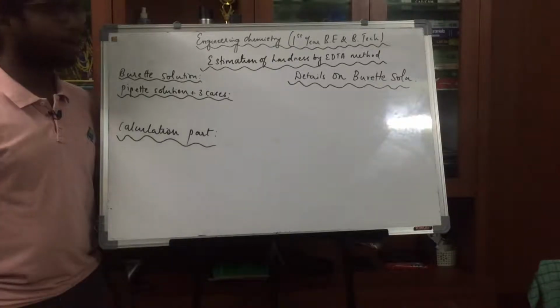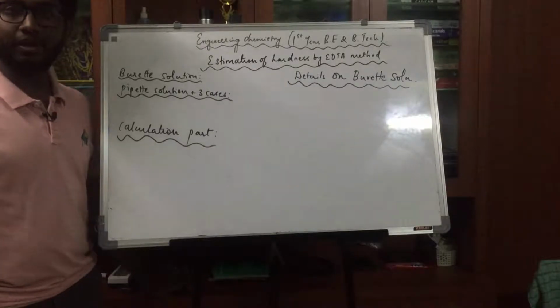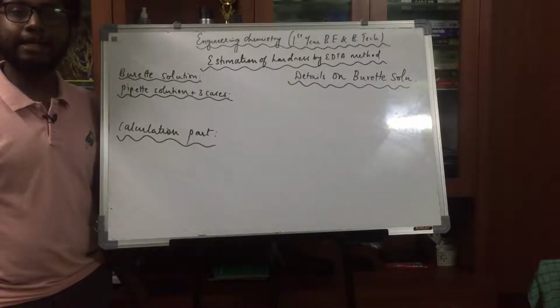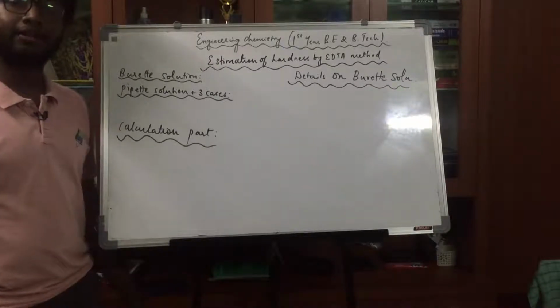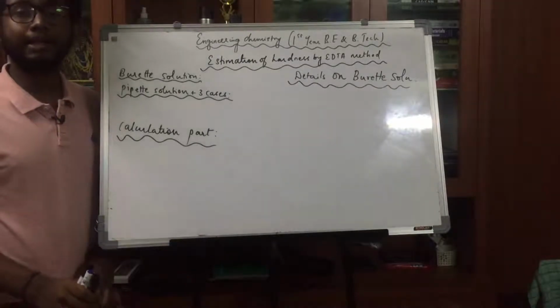In this video, we'll be doing the estimation of hardness of hard water by the EDTA method. EDTA is ethylene diamine tetraacetate, and in this method you will be making use of this compound to determine the hardness.